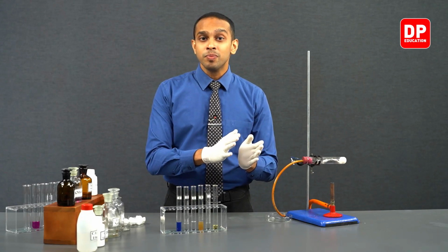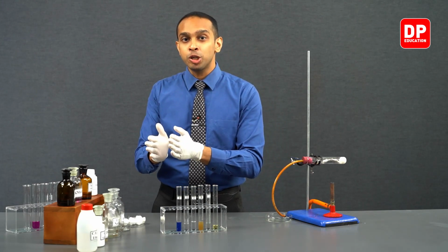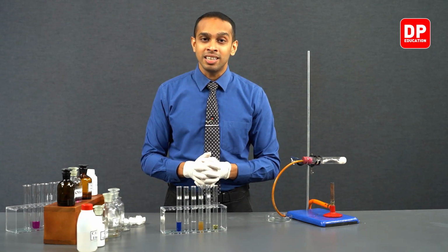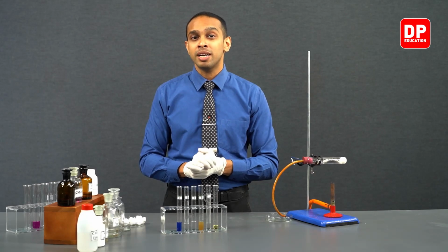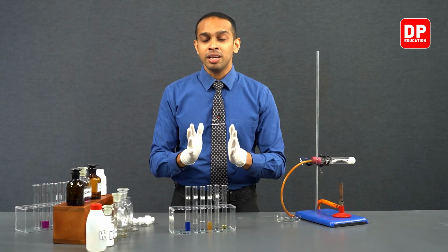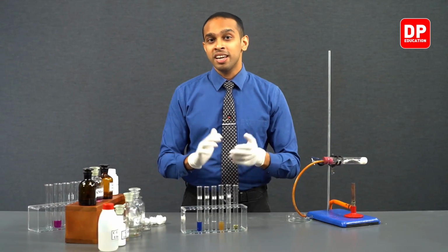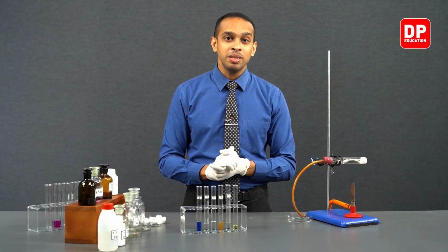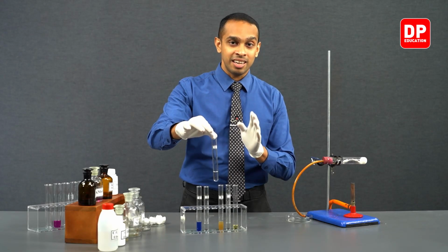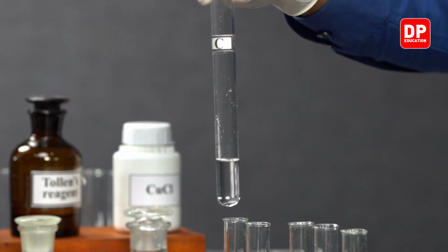In acidic medium, the permanganate ion can get reduced all the way to Mn2+. So Mn2+ ions are colorless. Although Mn2+ ions in aqueous medium are said to be slightly pink in color, this very low intensity pink color is very difficult to observe in lab environments. So we are going to observe the formation of a colorless solution instead.